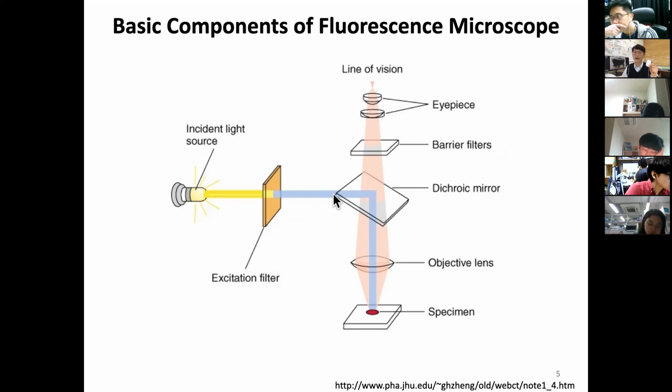So that light shines onto your specimen, right? The other parts don't do anything; they just scatter the light. But this specific fluorophore will emit another color of light, which is shown here as a dim red color. In fact, the emission goes out in every direction, but this only depicts those entering the microscope, because that's all we can see and care about, right? So this red color is coming out.